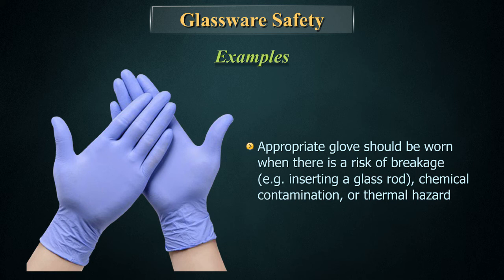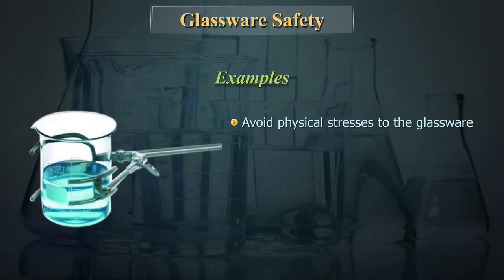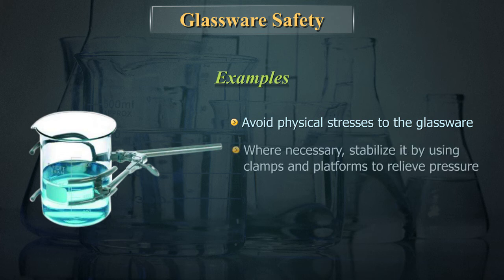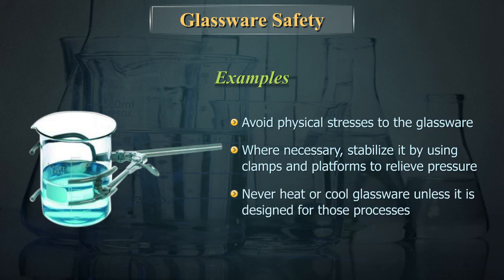Position one hand under the glass for support. Appropriate gloves should be worn when there is a risk of breakage. When handling hot or cold glassware, always wear insulated gloves. Avoid physical stresses to the glassware. Where necessary, stabilize it by using clamps and platforms to relieve pressure. Never heat or cool glassware unless it is designed for those processes.